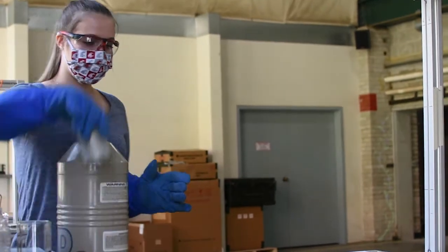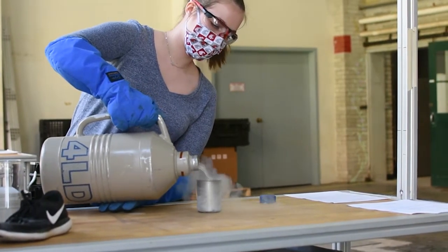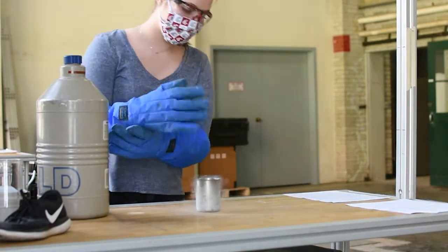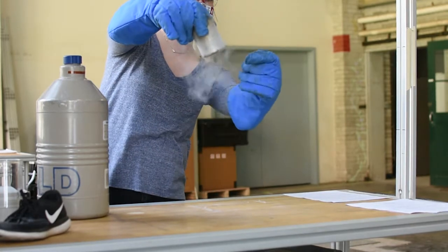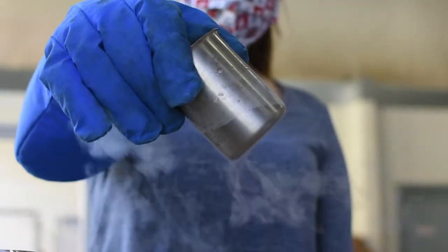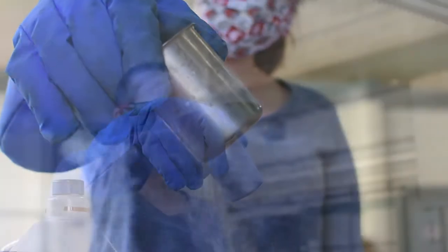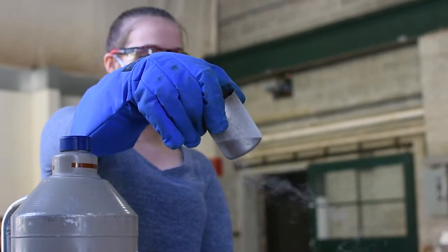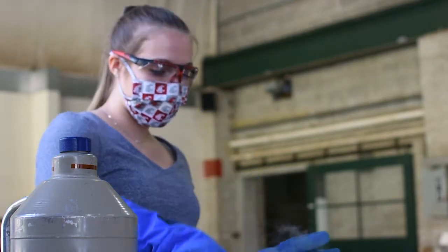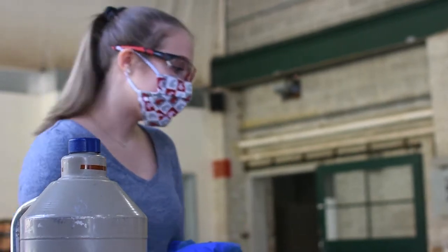So I've got my metal flask. This is going to be kind of hard to see from far away, but there's a little line forming here, and soon you'll be able to start seeing some drops come off the side. There we go. See those drops? That is the liquid air. Now let's say you were outside on a hot day. If that were to come in contact with the hot pavement, it could actually combust and start a fire. So always be aware of where you are handling your liquid nitrogen and where the liquid air is going.